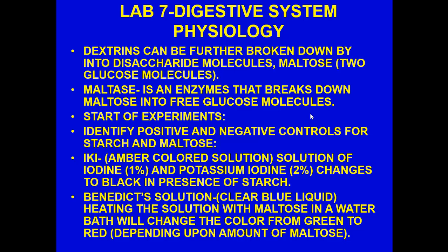There is a solution called IKI. It's also called Lugol's iodine. It's an amber-colored solution of iodine at 1% and potassium iodide at 2%, and changes to black in the presence of starch.